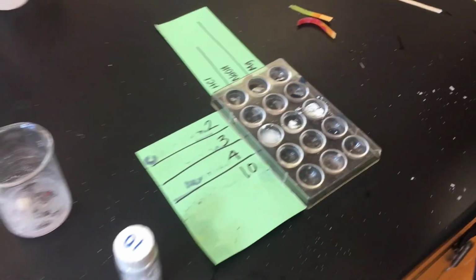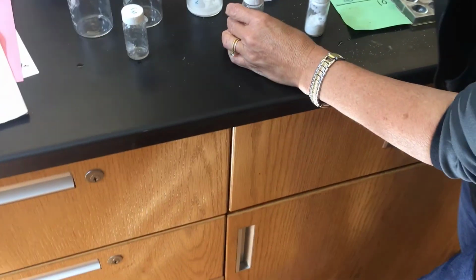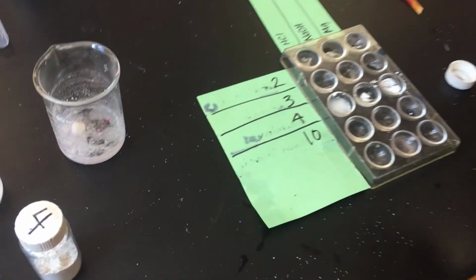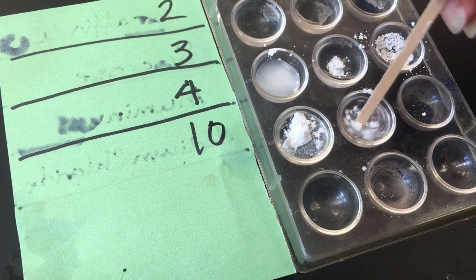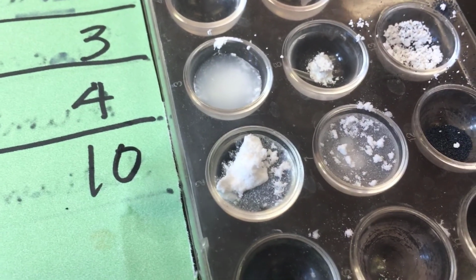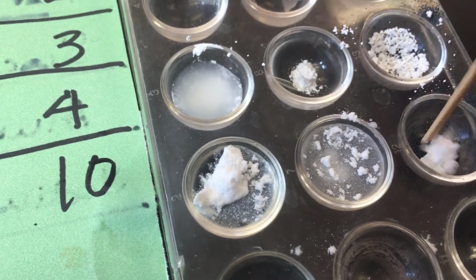Okay, and our last one is going to be sample 10. Same deal. Whoop, in the acid, doesn't really do much there. In the base, whoop, something more is happening in that one. A little bit. And in the magnesium.